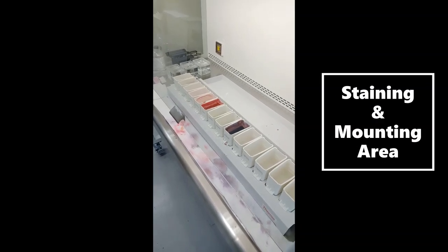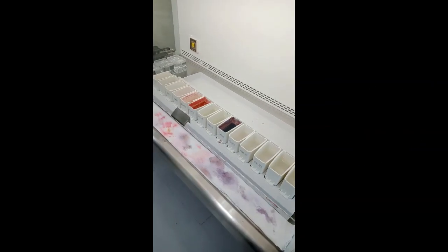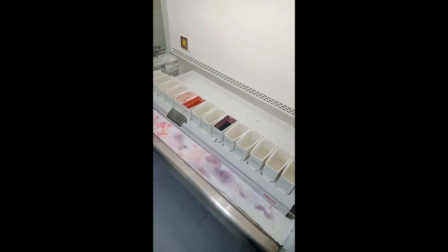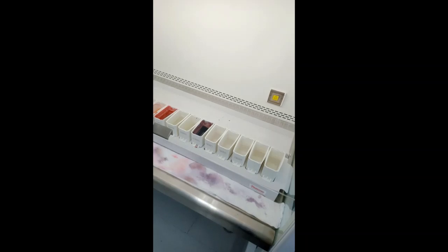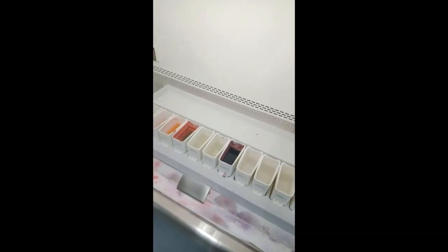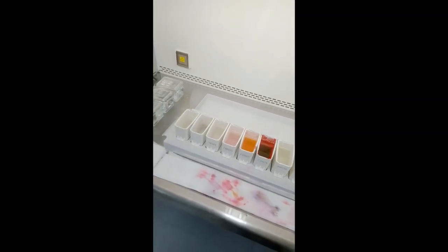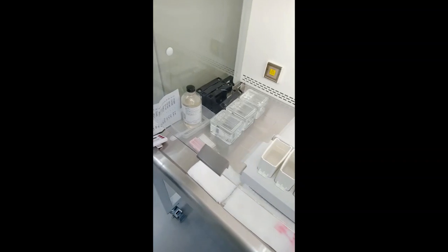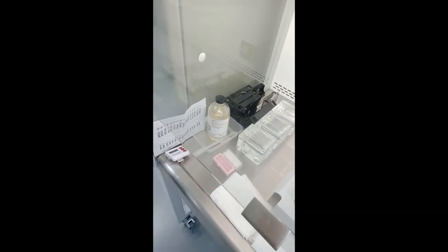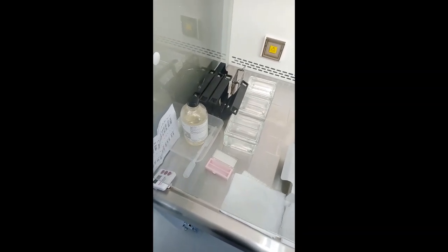Okay, so now this is our staining and mounting area. Staining is where we put all the glass slides that we sectioned into different chemicals, a step-by-step procedure, and different dyes and stains so that we can put coloration on the tissue. After we've done that, we use a mounting media right here and then place cover slips on the tissue. Once the tissue has been cover slipped, we go to the next step.